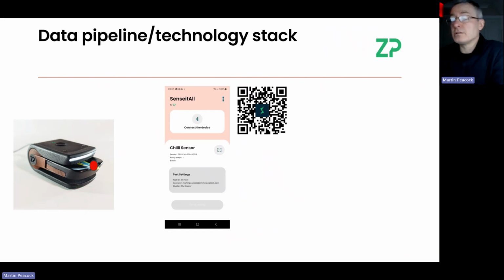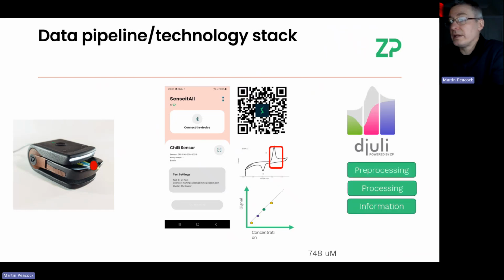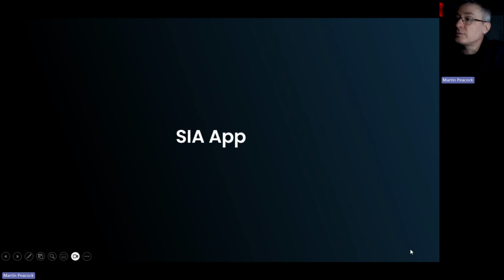The instrument gave the data back. We sent the data to the cloud. We processed it in the cloud, and we actually got, let's say, final concentration on the phone. So it's a very powerful data flow built into this system, including smartphones, cloud systems, Bluetooth. It's literally in the gathering of that data, no actual laptops were used.